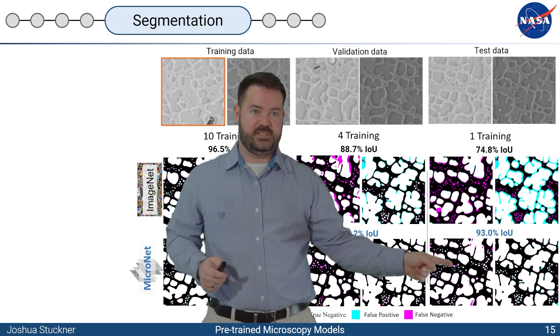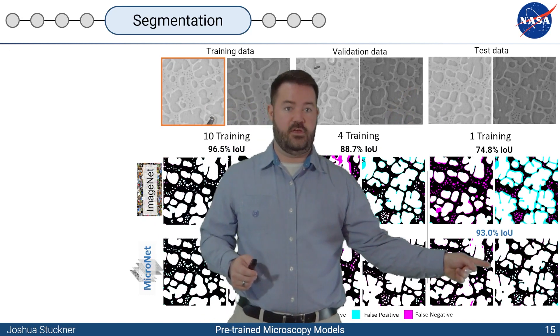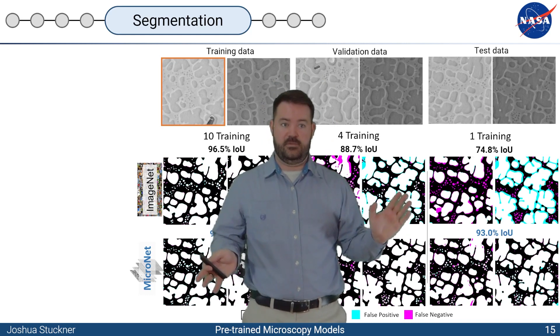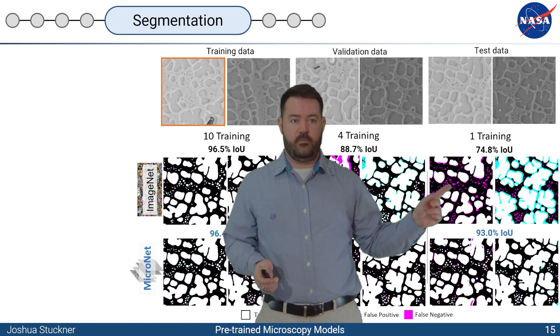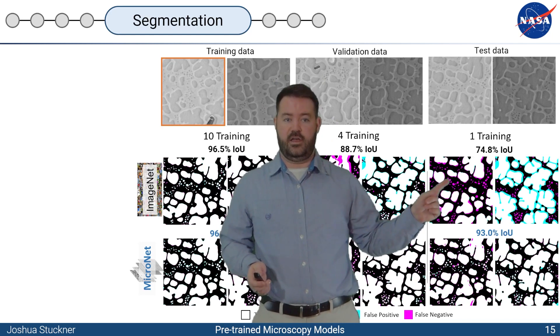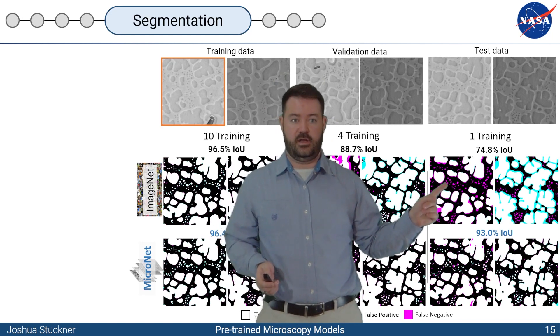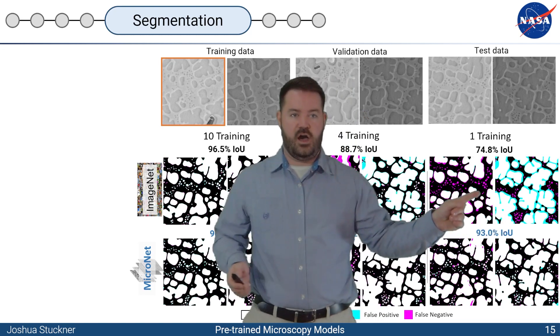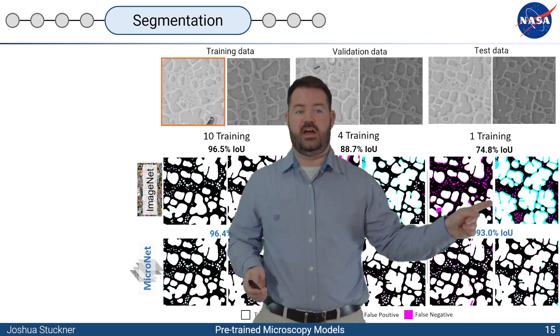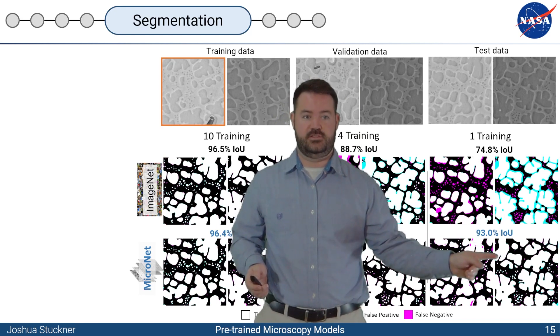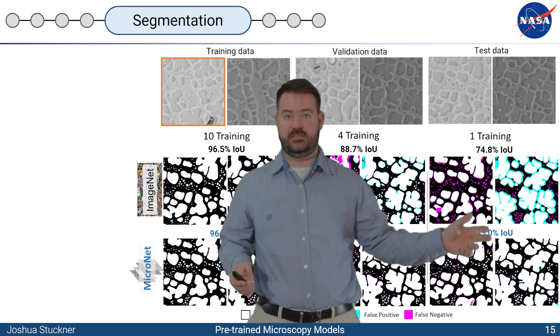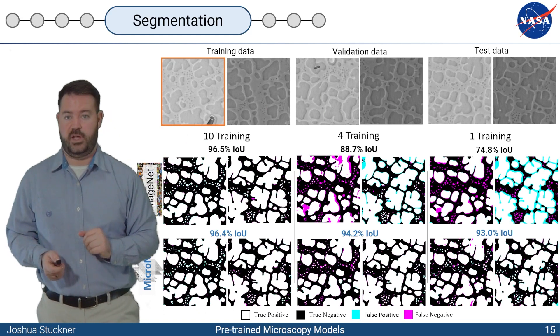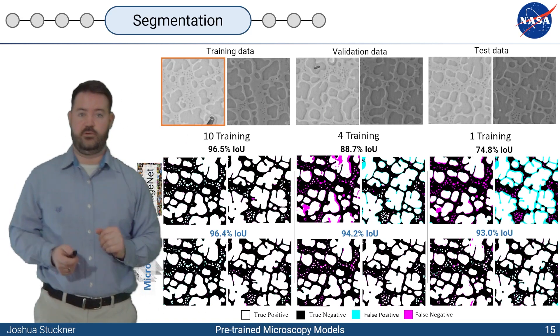These test images line up with this one here. And you can see, we're getting all the tertiary precipitates. Here, we're getting all the tertiary, even though the contrast is a lot different. Because the Micronet model has learned that microscopy images can be different contrasts, and it's still the same thing. But for ImageNet pre-training encoder, which is the one training image, we're losing all the tertiary precipitates here. We're over-segmenting. It's going to think of them as all one big blob, so we're not going to be able to do the analysis on that size measurements. Whereas here, we can do size analysis.